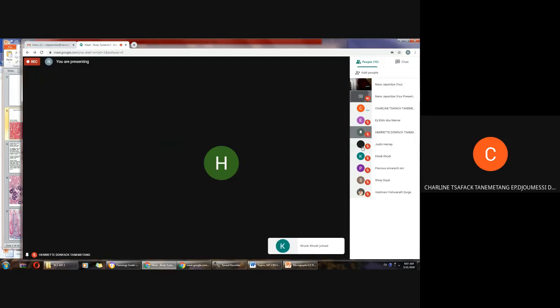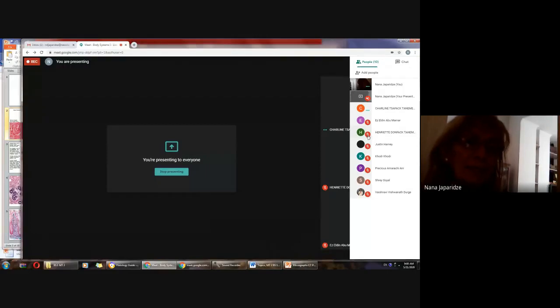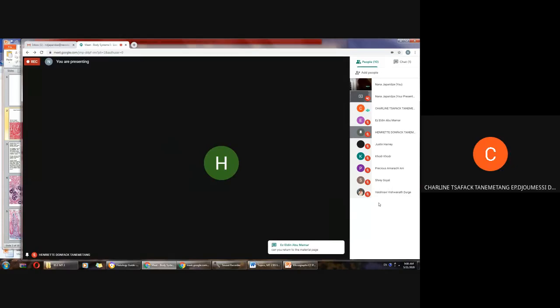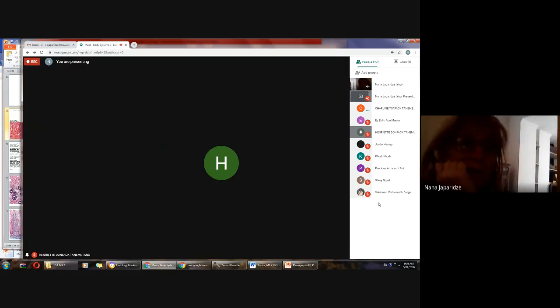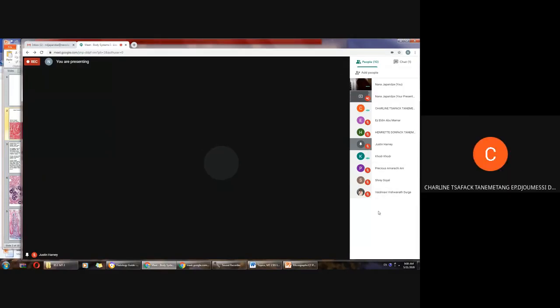I think the fibroblast has a big nucleus. Big nucleus. From the functional point of view, maybe Justin, can you give me the answer? Fibroblast is active, but fibrocyte is not active.